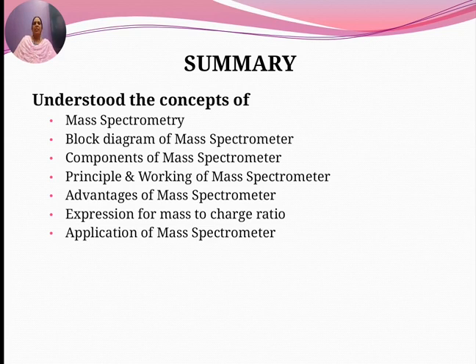Then the detector system: when the ion stream reaches the detector, the ions hit a wire. On hitting the wire, they become neutralized by electrons jumping from the metal wire to the ion. The amplifier picks up the current created between the wire and the ion and amplifies that signal. The computer picks up this signal and converts it into a mass to charge ratio, and a spectrum is produced.